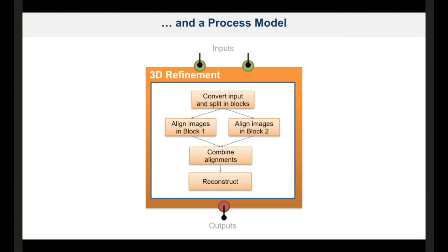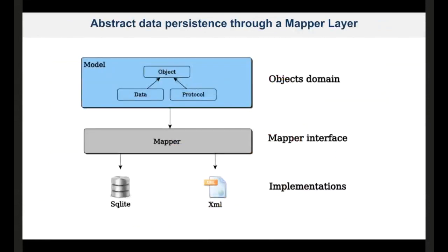These steps could be translated to calling a given program, or preparing files that allow going from one program to the other. And all this, the user can deal with at different levels. So they can see boxes in a more general overview, or can go into more detail and check what is going on behind the scenes.